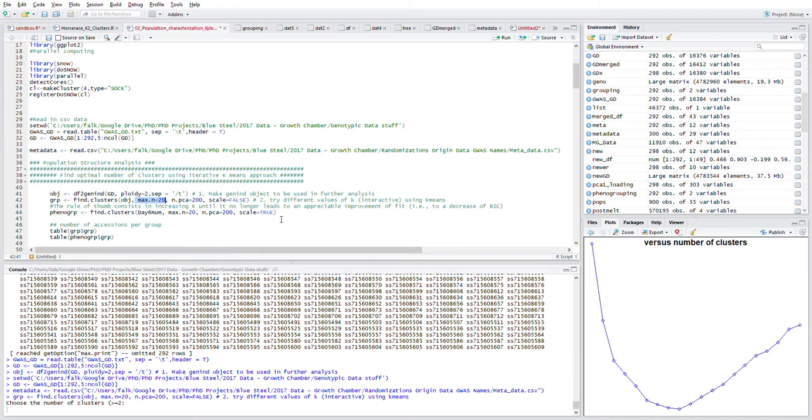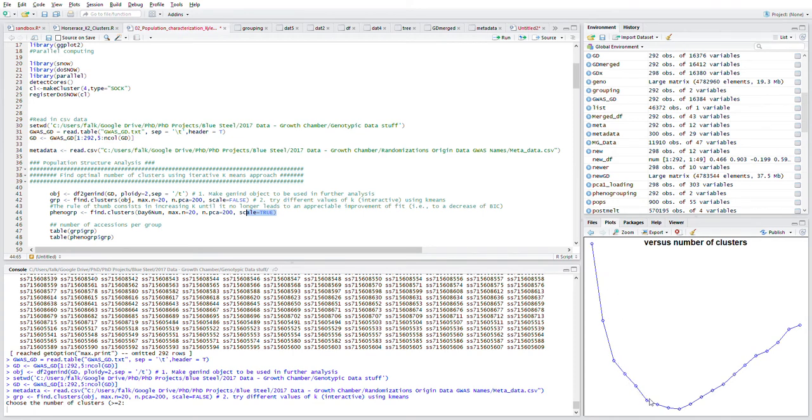It creates this BIC plot. For some reason the axes are missing, but starting at 2, 3, 4, 5, 6, 7, 8, 9, 10 - actually I believe that's 1, 2, 3, 4, 5, 6, 7, 8, 9.